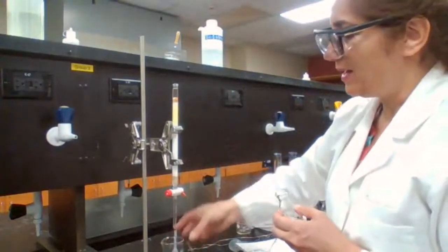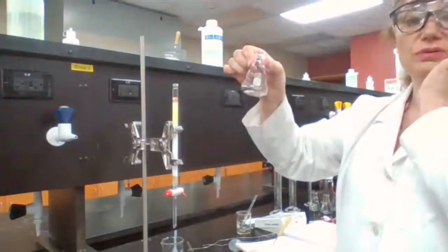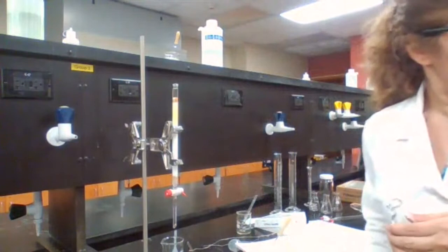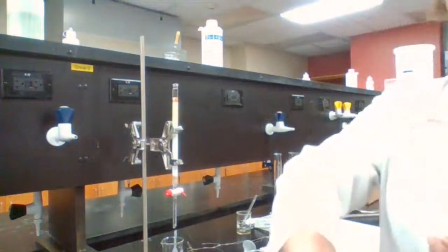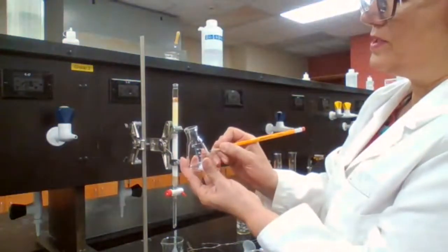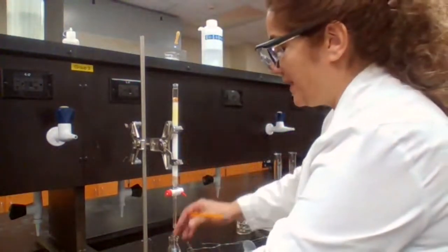And I cannot elute the fluorene into the waste container. I have to change this to collect in flask 1, which is fraction 1. Going to the collection flask.